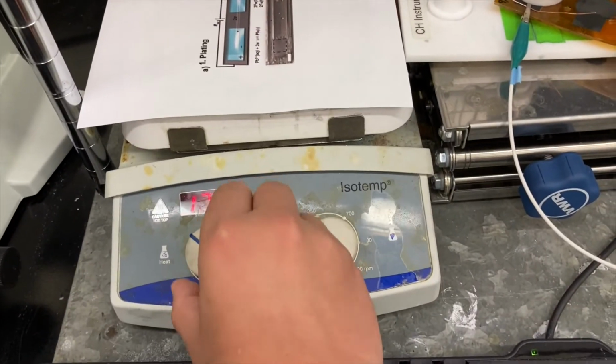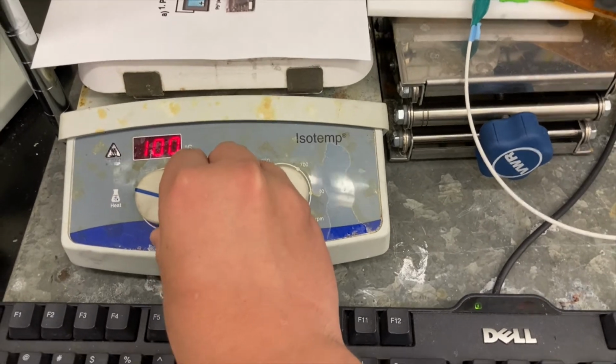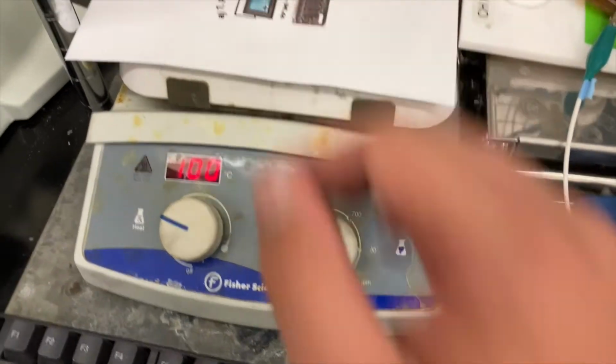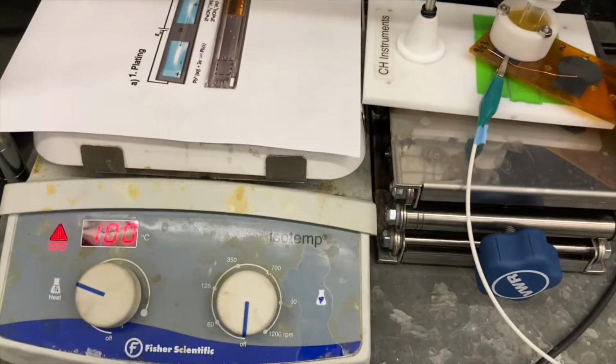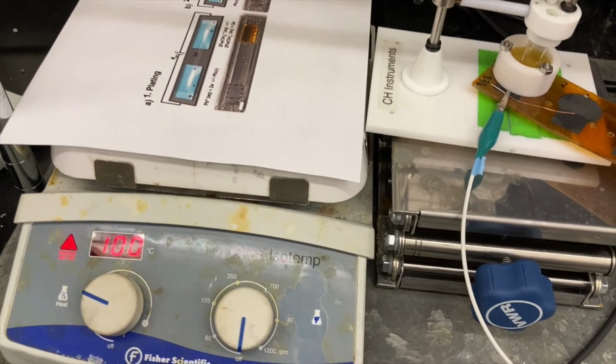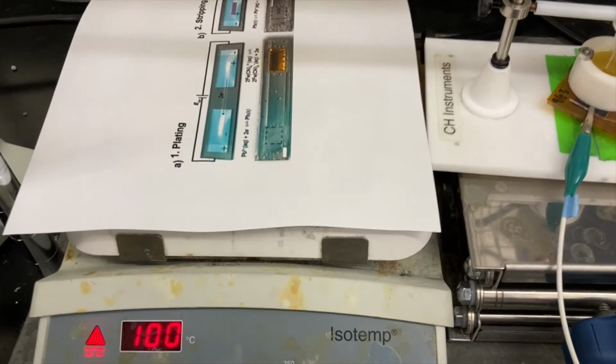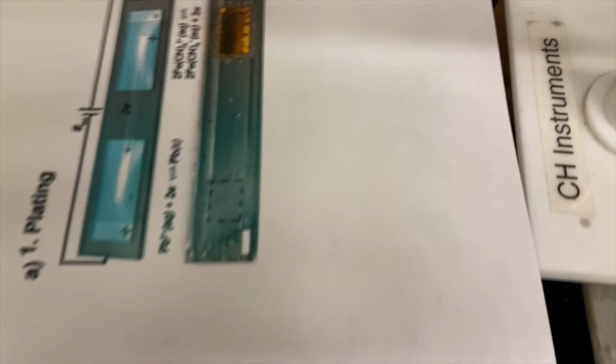You're going to turn your hot plate up to about 100 degrees, minimum of 90, and you're just going to leave it until you see the kind of color and shininess of the wax start to change just a little bit. As the wax starts to sink in, you might notice a slight color change. You can see the little green coloration to it compared to up top here.